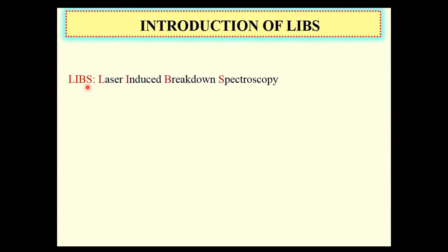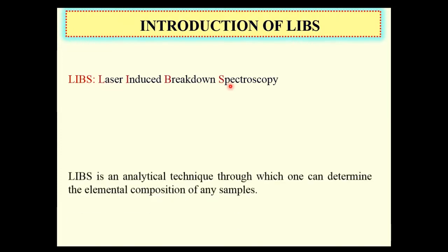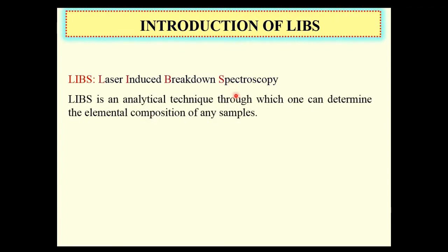Introduction of LIBS. LIBS basically stands for laser induced breakdown spectroscopy. It is an analytical technique through which one can determine the elemental composition of any sample. The sample may be in the form of a solid, liquid, as well as a gaseous form.